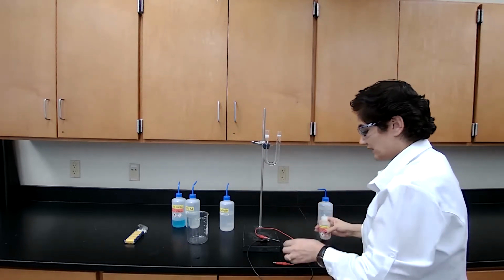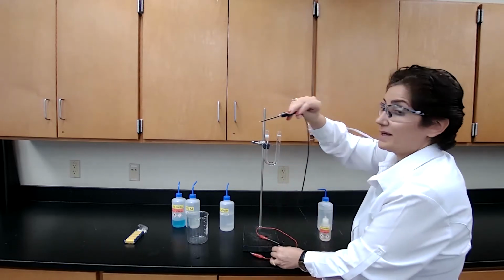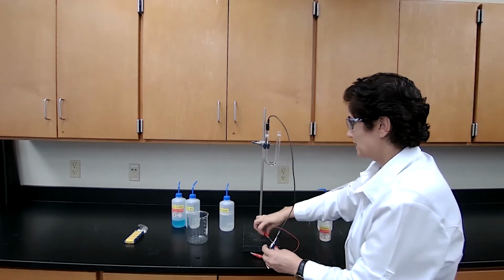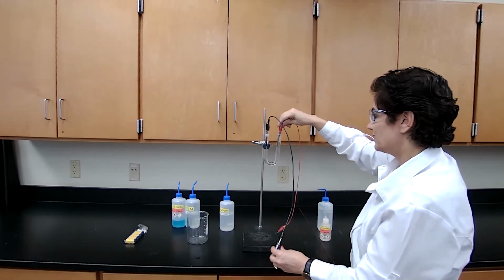One drop on each side is enough. And I'm going to place the electrodes; it doesn't matter which one is cathode or anode.